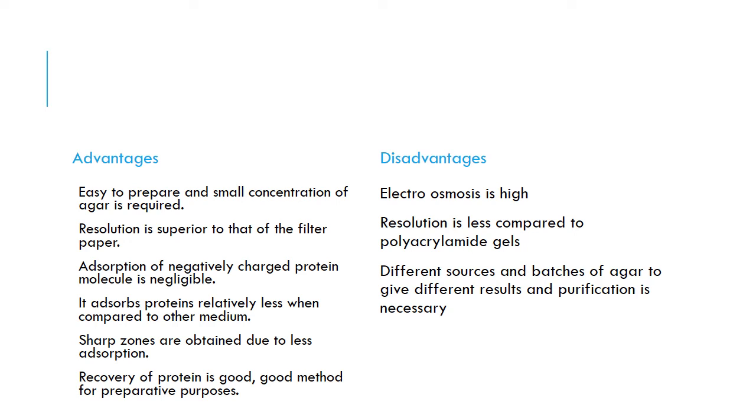Again, we have the third one here. That's the third advantage, which is that the adsorption of negatively charged protein molecules is negligible, and it also absorbs protein relatively less when compared to other media. So sharp zones are obtained due to less adsorption. Also, the recovery of protein is good, so it's a good method for preparative purposes.